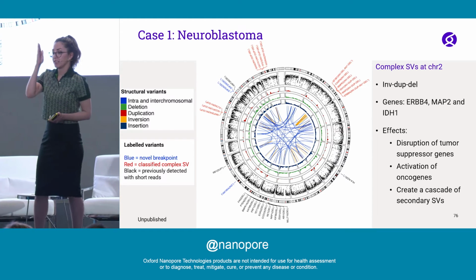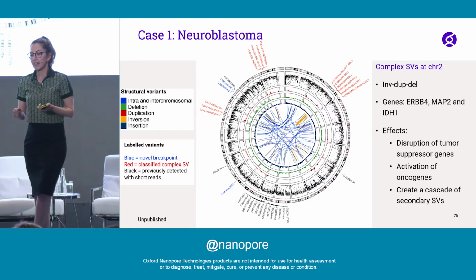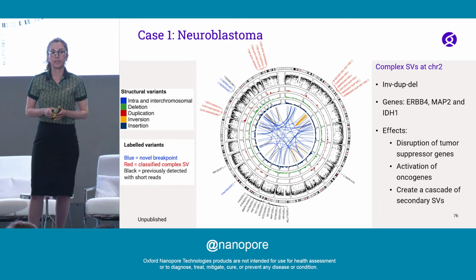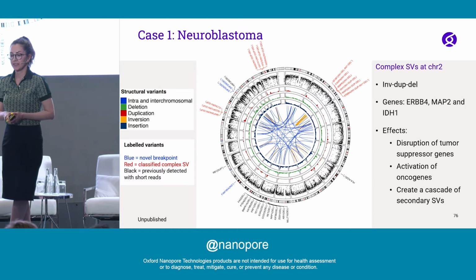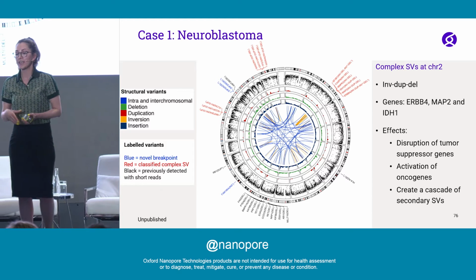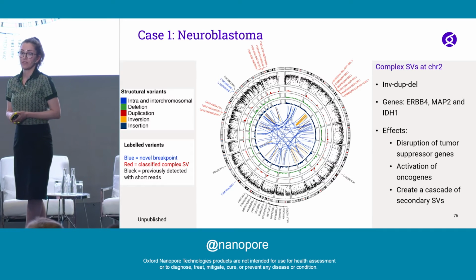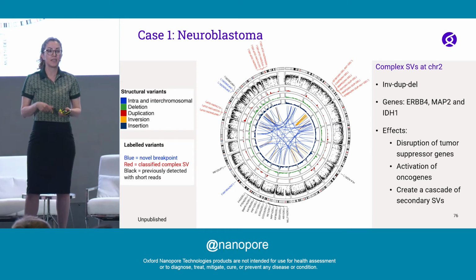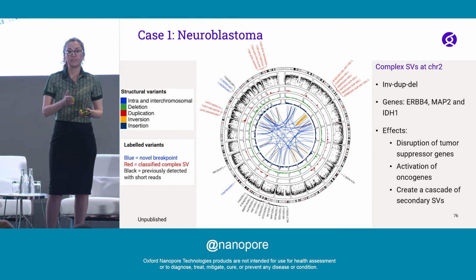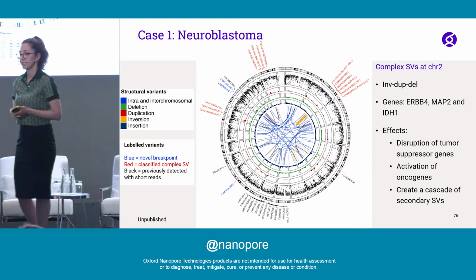In the circus plots, if you consider 12 o'clock, chromosome 1 is clockwise, then 1, 2, 3. The outer layer is the inter-breakpoint distance. Then we have the density plots of the duplications, deletions, and insertions. In the middle, we have the links of the intra- and interchromosomal SVs and also inversions. The reason we are separating them is that, in terms of the catastrophic events in the cancer genome, the ways of the different SV types are quite different. So inversion and translocation are quite important.